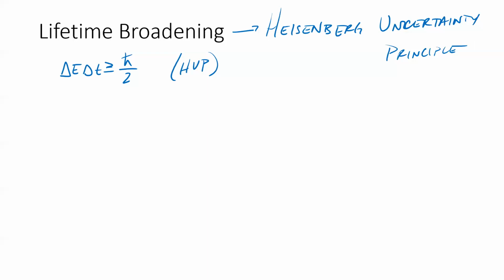Now the thing about that emission is that it happens isotropically. It happens all around the sphere that is the atom. It could happen in any direction. And so even though I absorb it in one dimension, it doesn't necessarily have to emit in that same direction. It could emit anywhere isotropically around that atom.